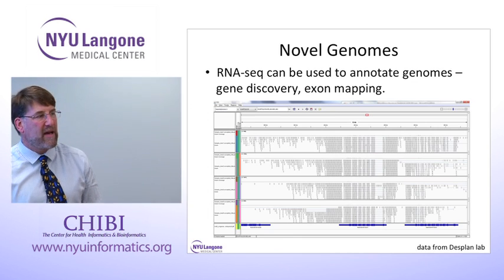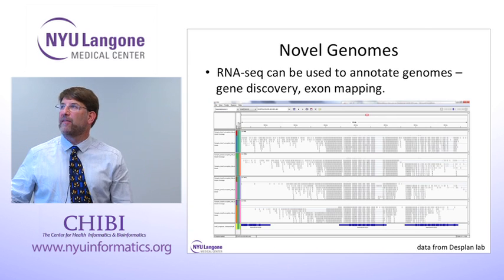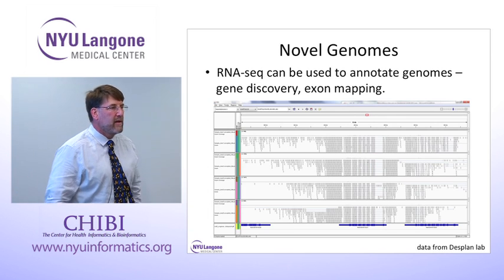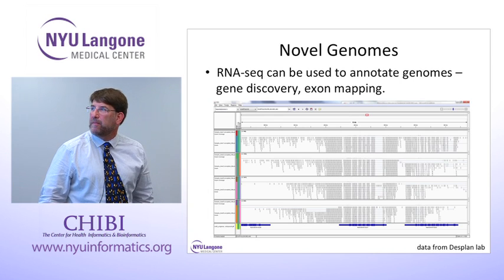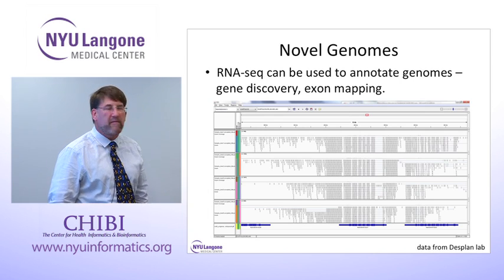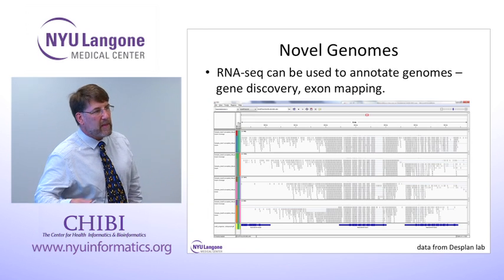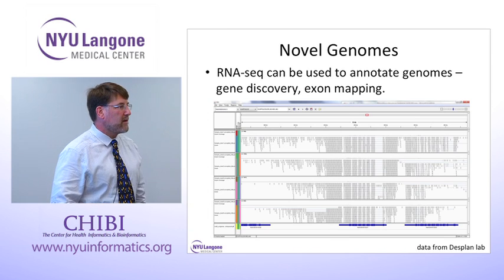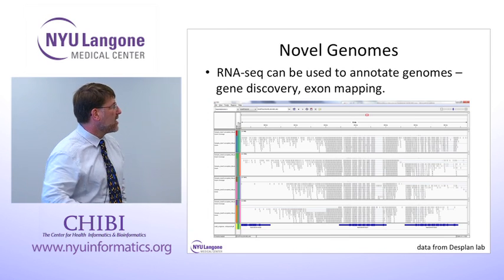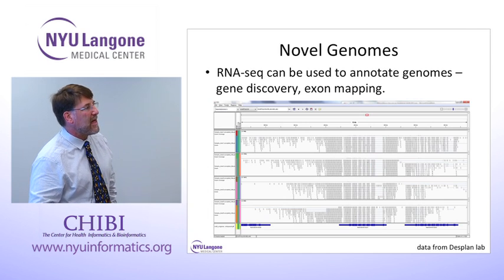If you don't even have contigs of genome sequence against which to map, then you're left with de novo assembly. And we've been using this tool called Trinity. And the main point here is that this is a very, very computationally intense process. And to run this on a 200 million data set took us a week. So it's not something that we can do on lots of samples all at once. And it's kind of a last recourse.